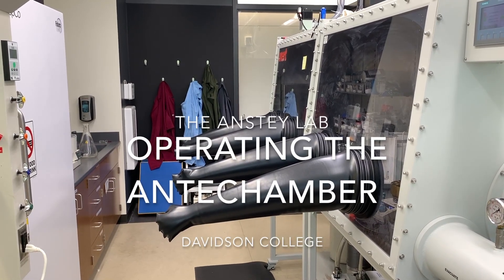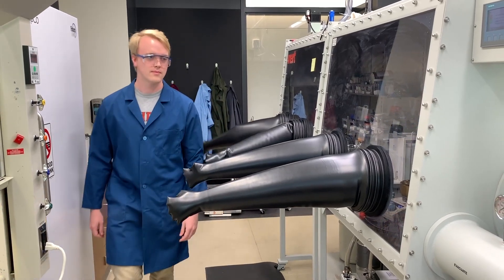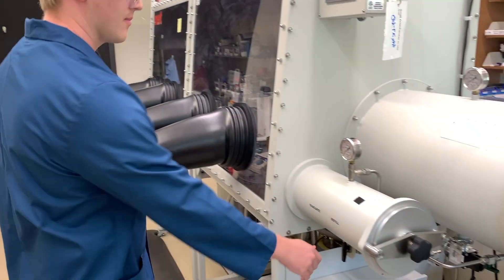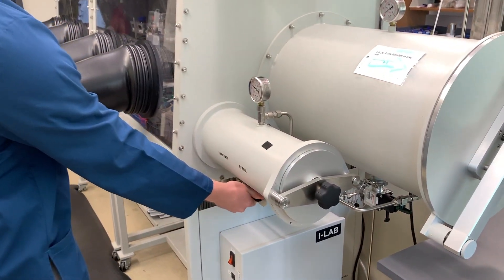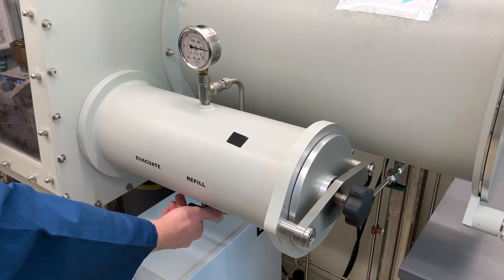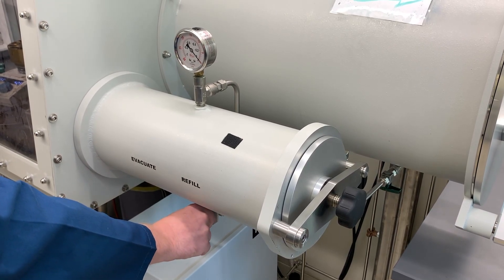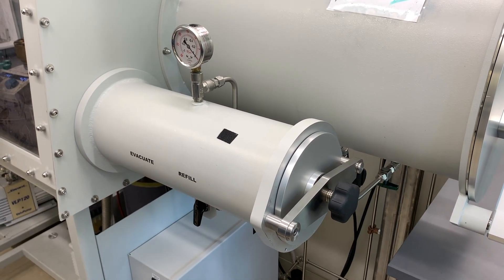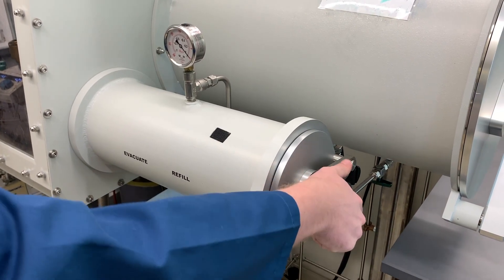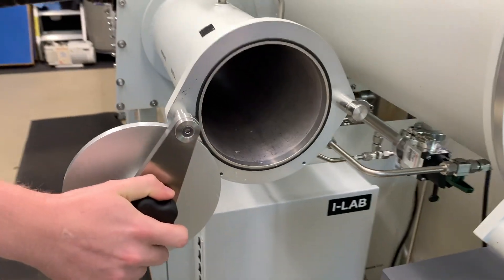So you want to use the antechamber? Then come along on this journey into the glove box. The antechamber is the gateway through which all chemicals, supplies, and equipment must pass through to get into or back out of the glove box. Think about it like the airlock on a space station or in a submarine. An airlock protects the inside of the space station from exposure to the vacuum of space. Our antechamber protects the glove box from the oxygen and humidity that can destroy our sensitive chemistry.